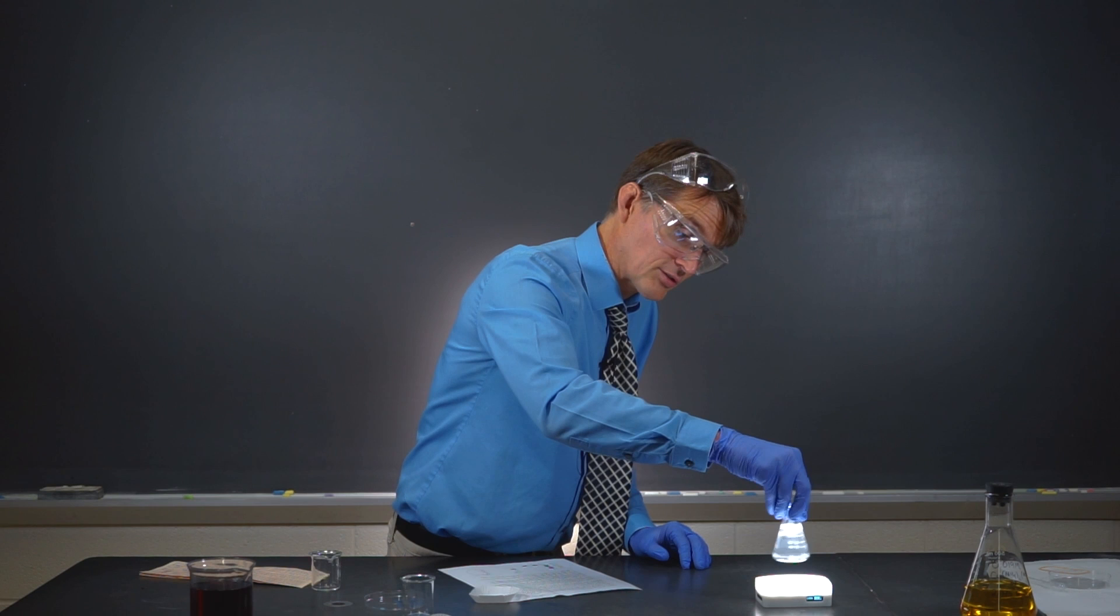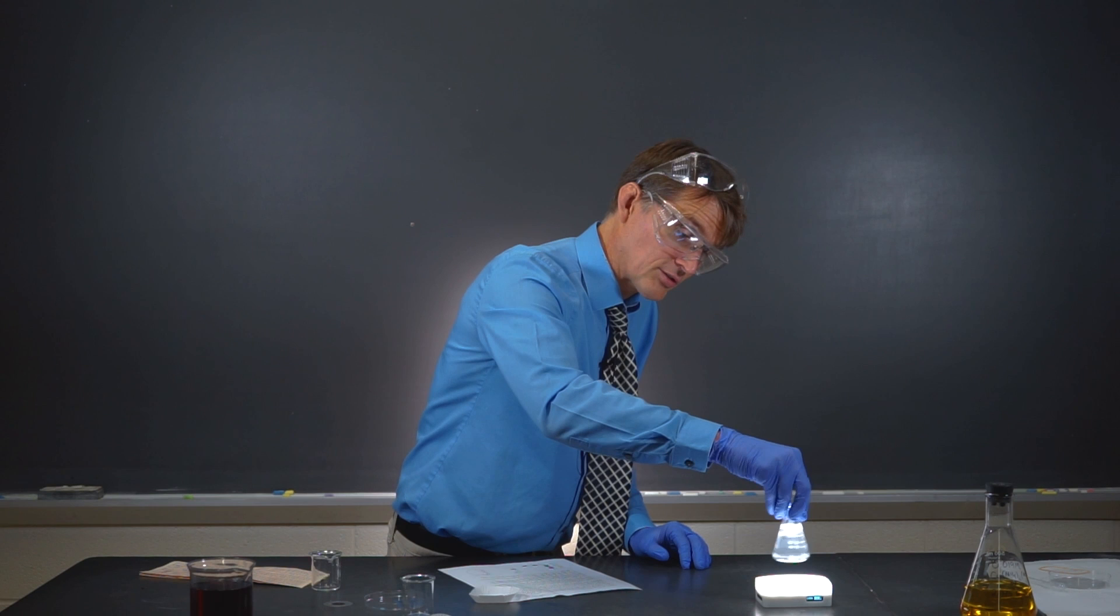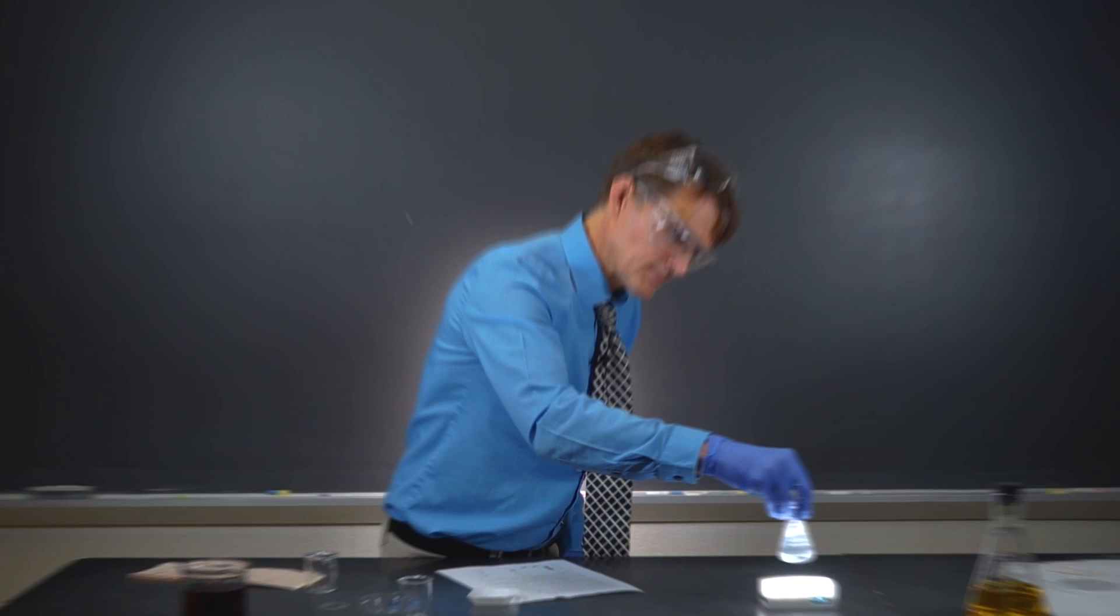Now first, we just want to get some of this iron sulfate dissolved in solution to give us the iron ions we need. It's going to take a while to dissolve. We're getting there. Almost. Probably good enough.